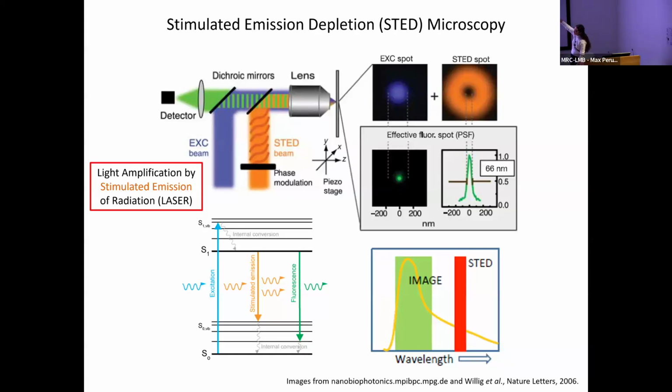But more importantly, how does the STED switch off the fluorescence? When you excite a molecule, it goes to the excited state. And when it sees the STED donut, instead of emitting fluorescence in a regular way and creating those green photons, for example, you just force that excited molecule to emit at the same wavelength as the donut.